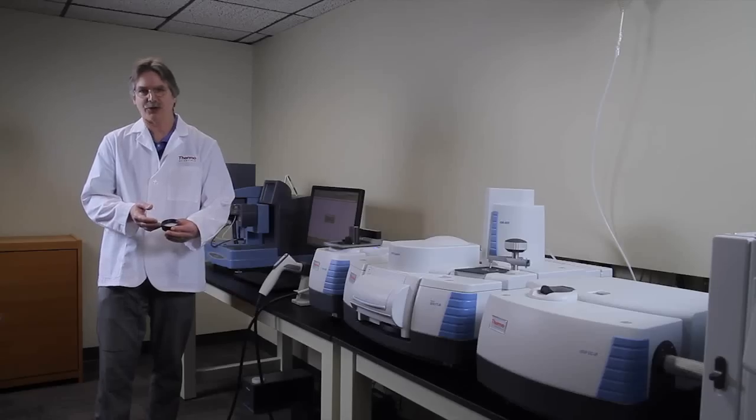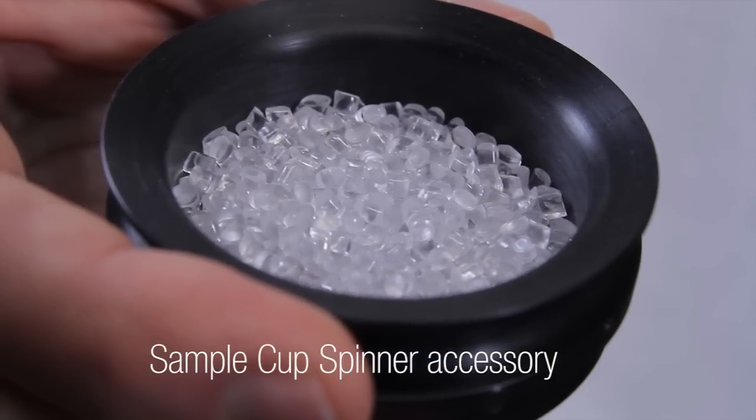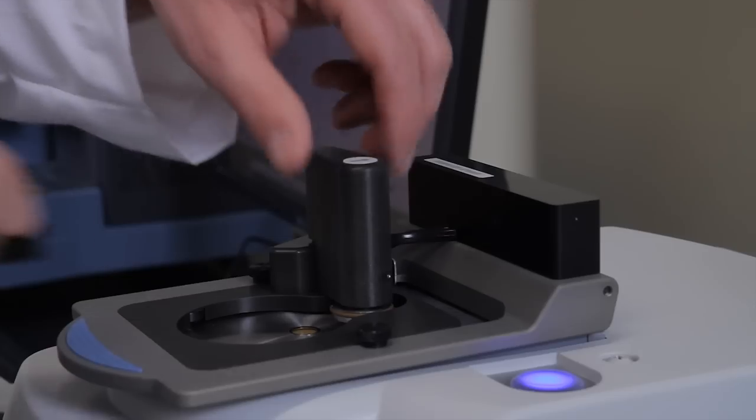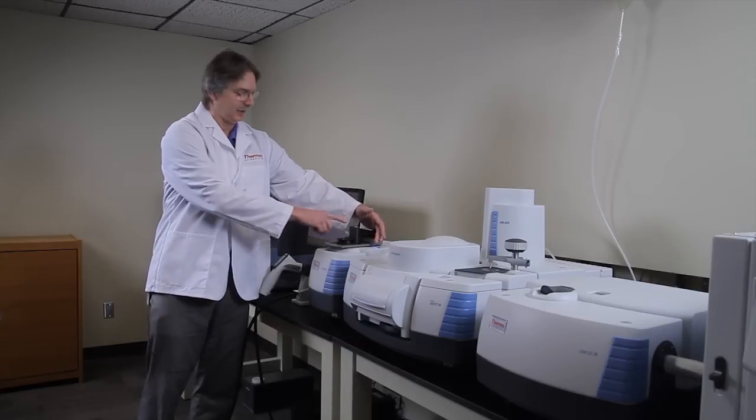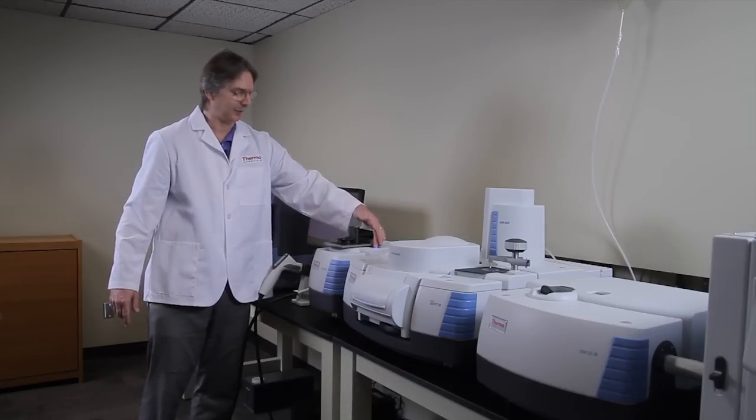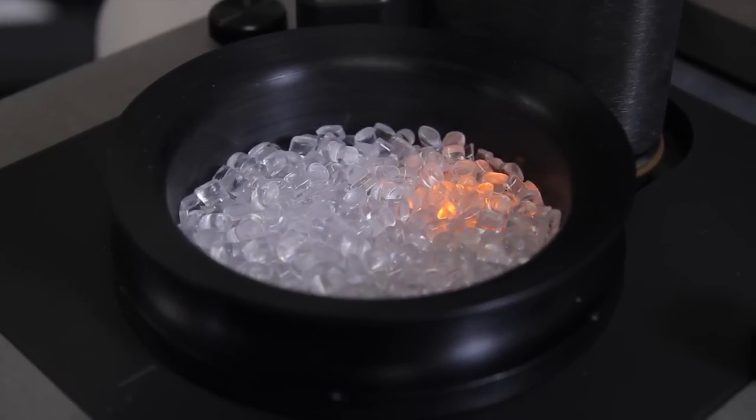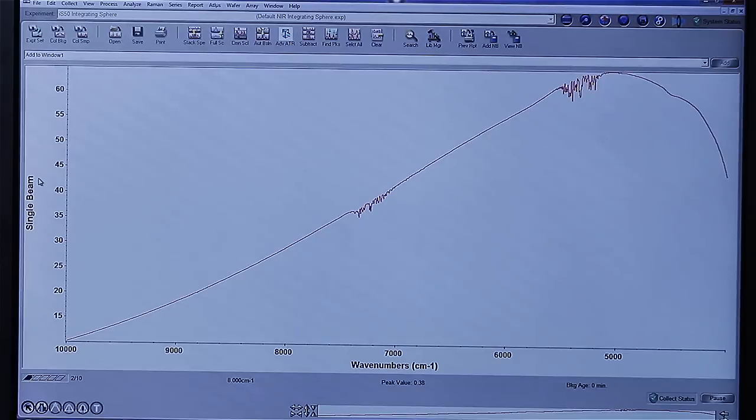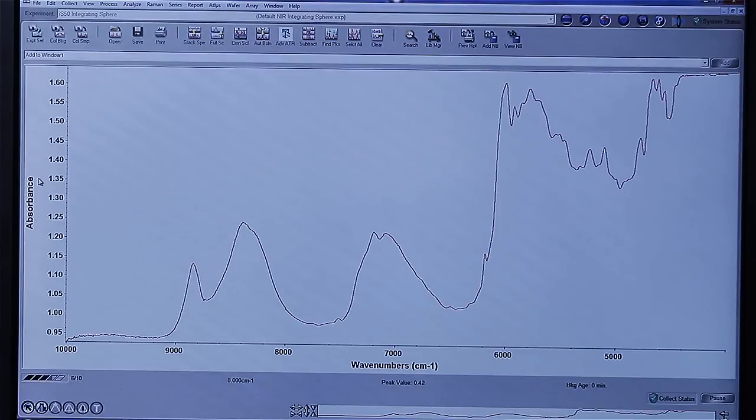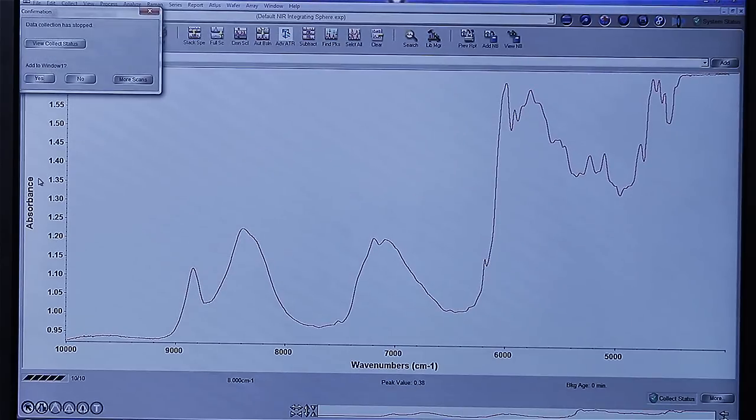Once the background spectrum is collected, we can just put our sample on the integrating sphere. And right now, I have some polymer pellets that we'll put onto the integrating sphere. We push the button again. The sample cup spinner will spin, allowing you to collect more uniform data. And then when the analysis is done, the spectrum shows up on the screen.